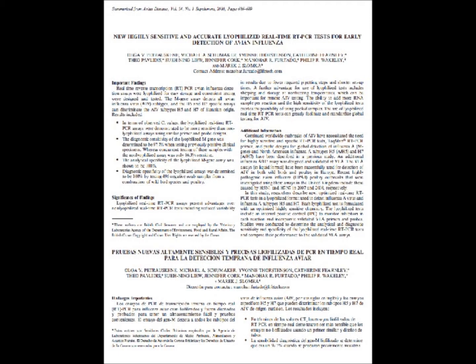One is the enzymes and oligonucleotides and the NTPs and material that typically form a liquid PCR reaction can now be in a single tube and remain inactive as long as you need to. So when you ship the assay around and it goes to labs, you can typically store this at room temperature or at 4 degrees centigrade, and it's stable for long periods of time.